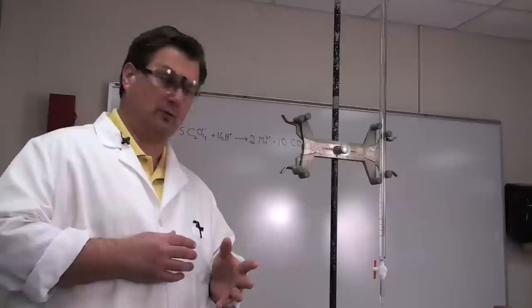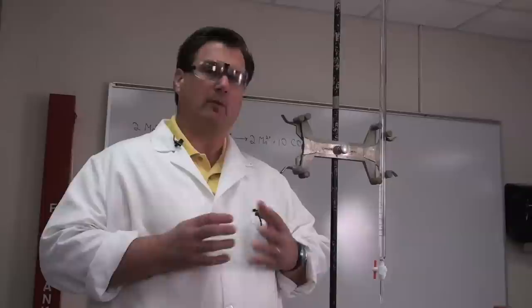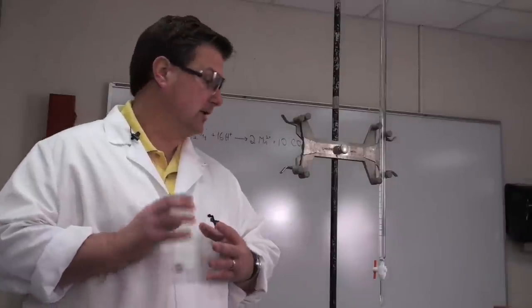The other difference is that this titration has to be carried out at an elevated temperature, typically in the 60 to 80 degrees Celsius range. So we've got to warm our solution before we do the titration. Alright, so let's begin.